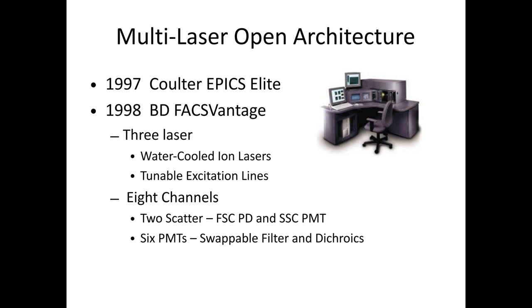We were all using the CellQuest software, but this was back in what I want to call the LP record days. We were still using analog systems. Just like an LP record where you hear the little hisses and scratches, there was built-in noise to the system in the log amplifiers that gave a certain visualization effect to data, especially during compensation.